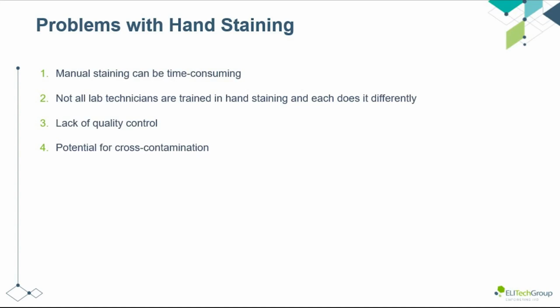If you're not doing very many, and it's just once in a while, it might be the way to go, depending on your lab and your lab's financial situation. But there's definitely going to be some issues as you go along that route.